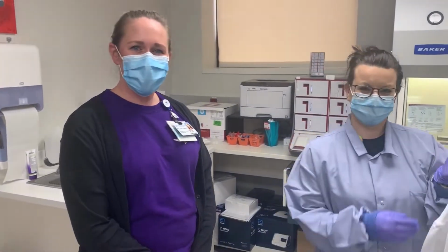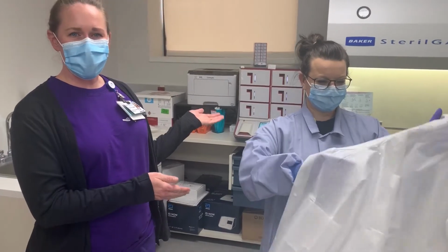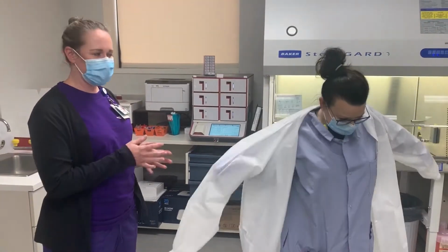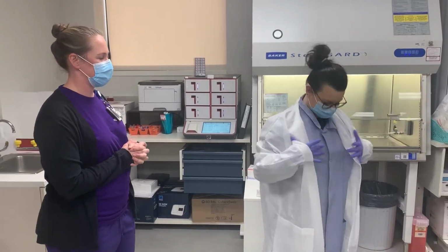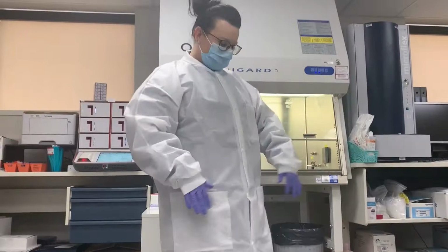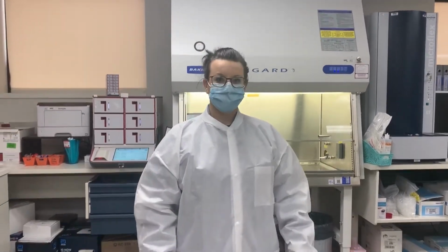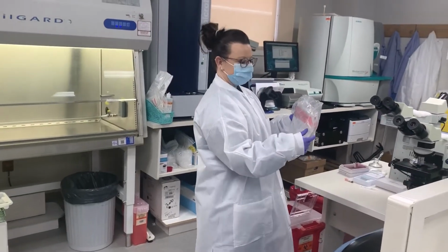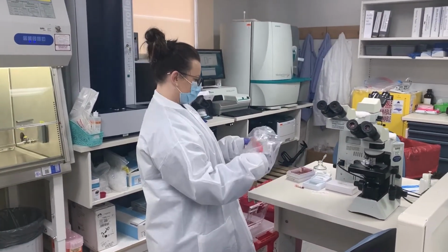So what we're going to do today is Jessica is going to walk us through the proper donning of the PPE and how we set up all of our samples for COVID testing. So Jess is first putting on her paper lab coat. Okay, so once Jess has that completely buttoned, she's now going to put on her face shield that will protect her from any sort of splattering or aerosols.